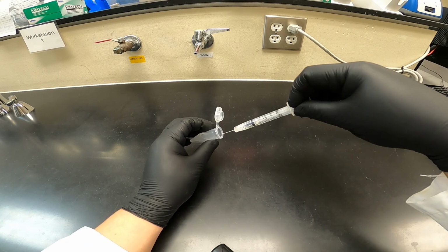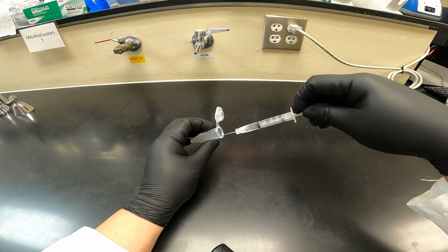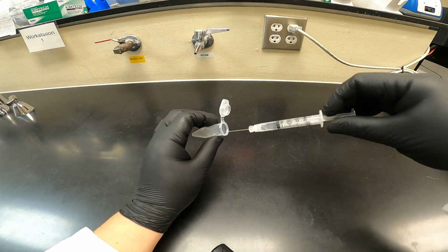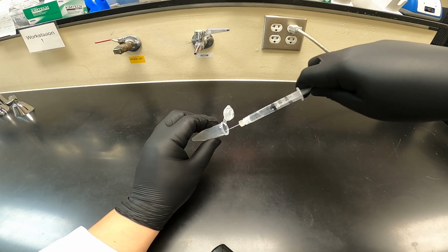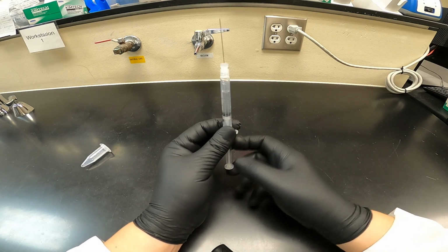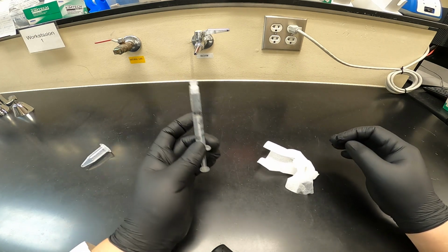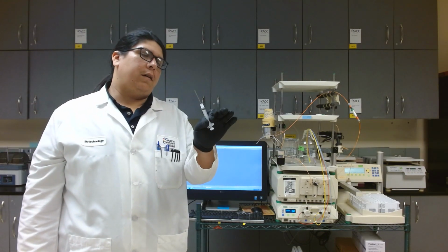I'll place it in our sample, and then be very slow when you're drawing the sample up. If you pull too hard, because of the small opening on the needle, you could cause foam to enter. So again, I'm going to draw a little bit more than 1 milliliter. Now what we're going to do is just remove this little excess air here. Now we can put this onto our system. Okay, so now this is our sample here.